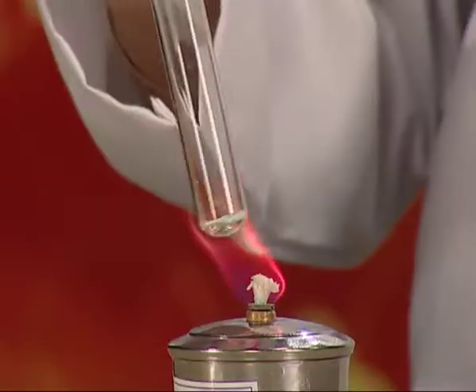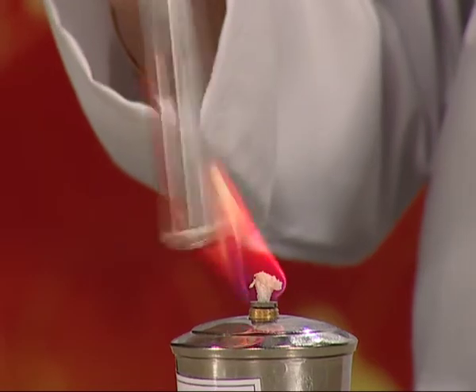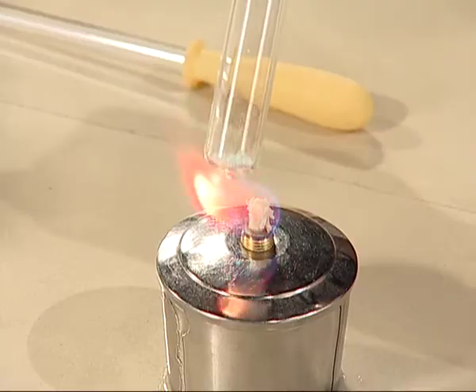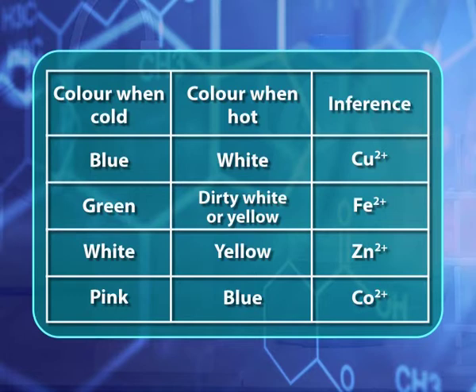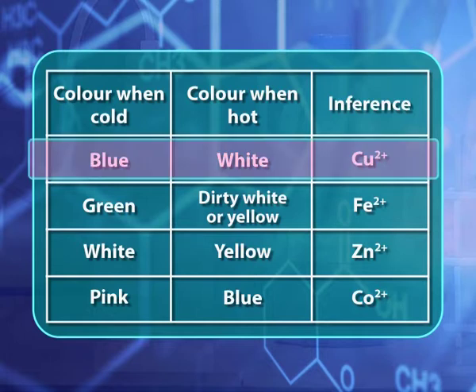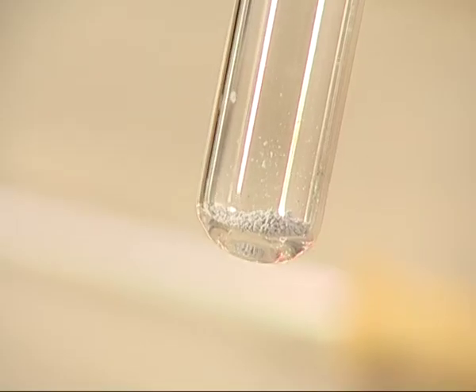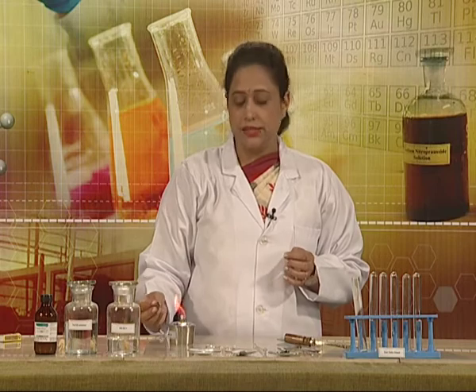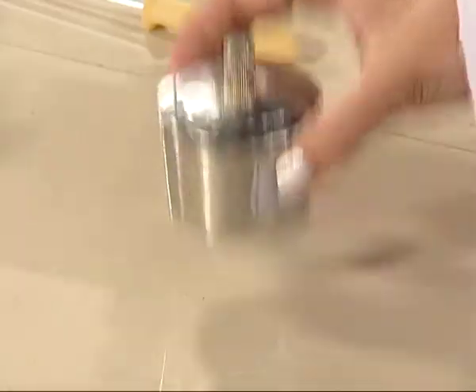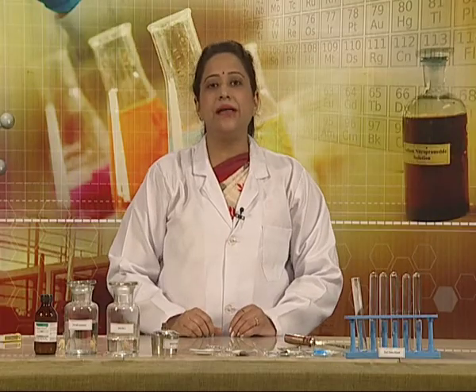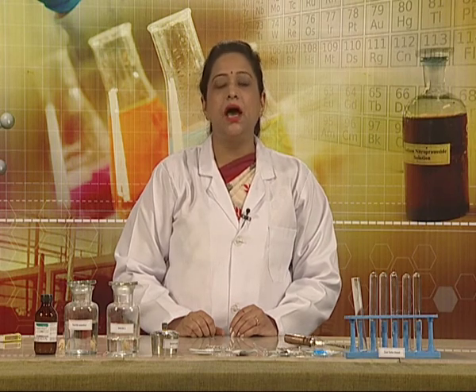As we can clearly see, on dry heating, the color of the copper salt has changed from blue to white. Thus, preliminary examination helps us to indicate the presence of the cation in the given salt. We shall now proceed to the wet analysis. After this, systematic confirmatory identifications are made by preparing the solution of the salt.